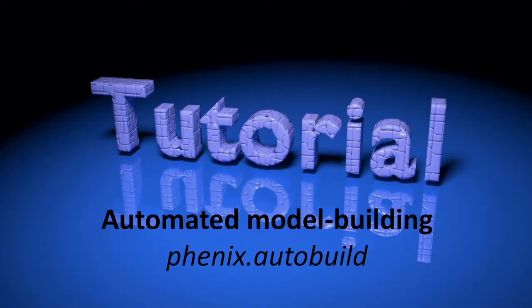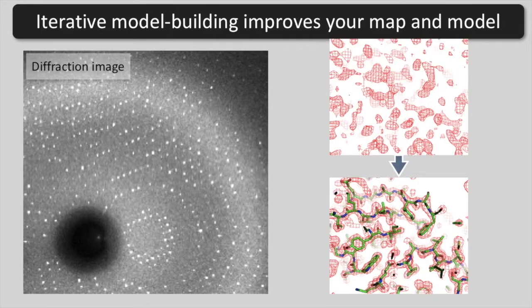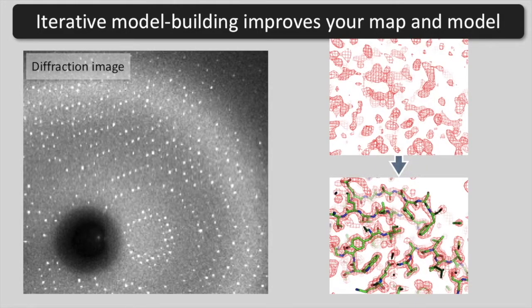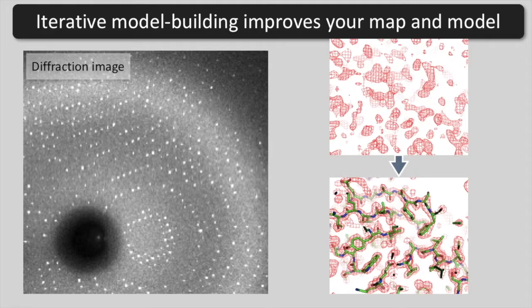Today we are going to carry out automated model building using AutoBuild. Iterative model building is a way to simultaneously improve the quality of your electron density map and to build a model.